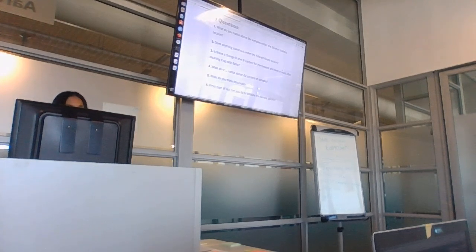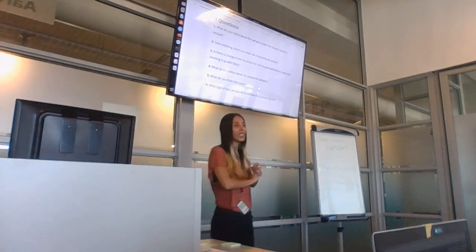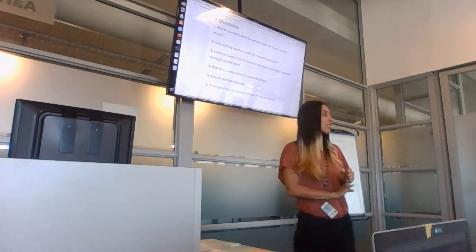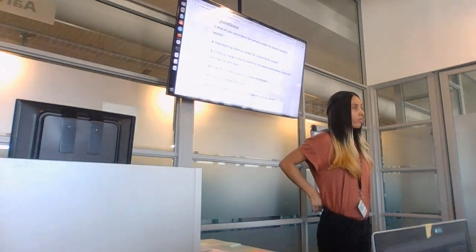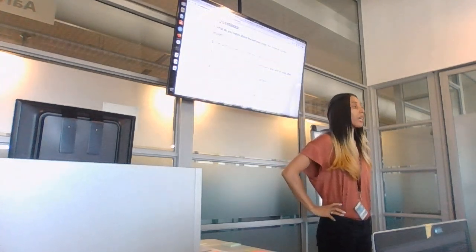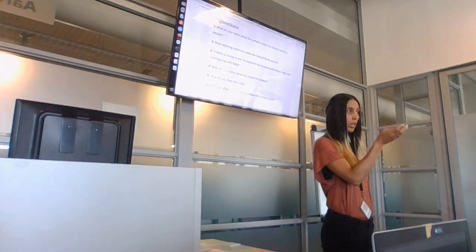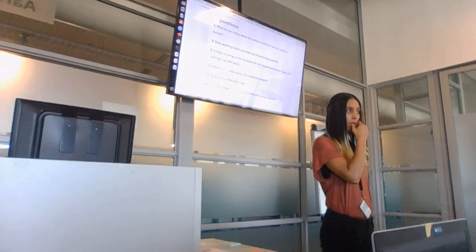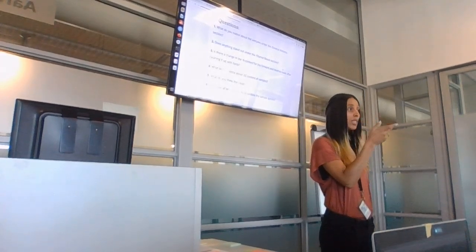What do you think this GC content could mean? And do you know of anything that you could do to test what is happening? If you get a sample like this, Dafa, you once had a sample of SARS-CoV last time. Do you remember what we did? You don't have to remember, I don't want to put you under pressure.